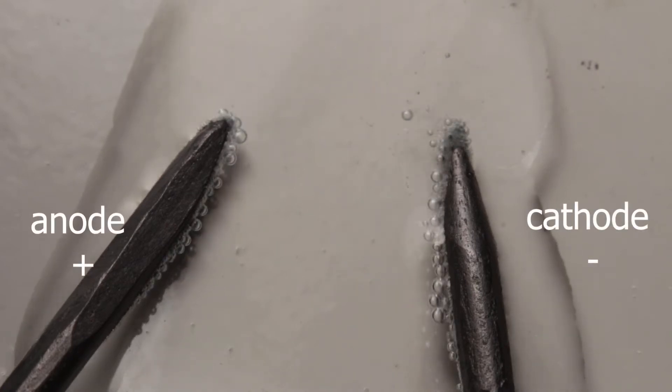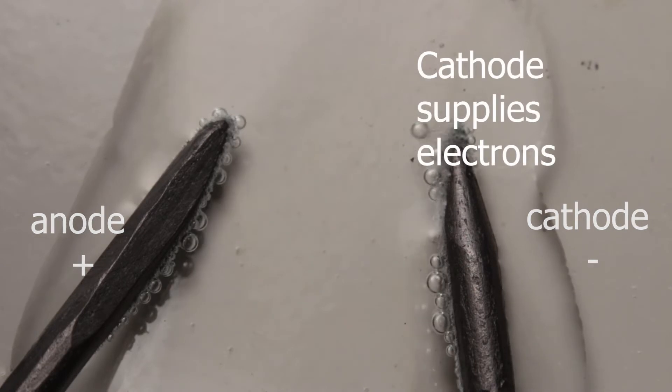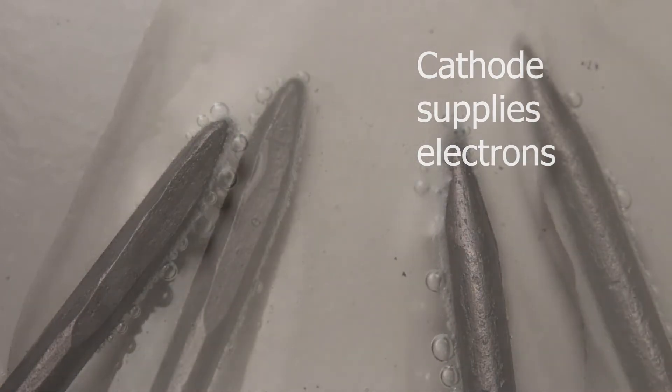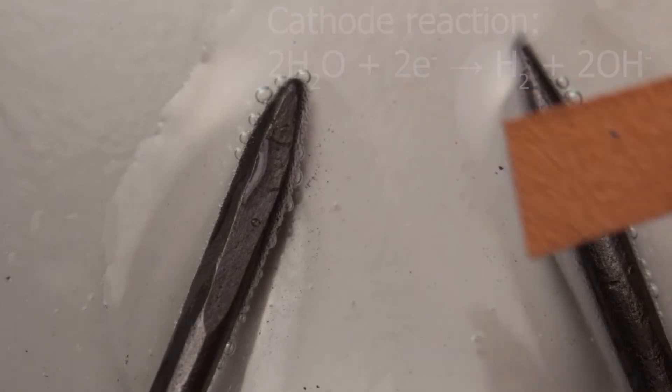You can see as I switch on the current, formation of gases on these two electrodes. Which gases are those? And maybe there are other products.